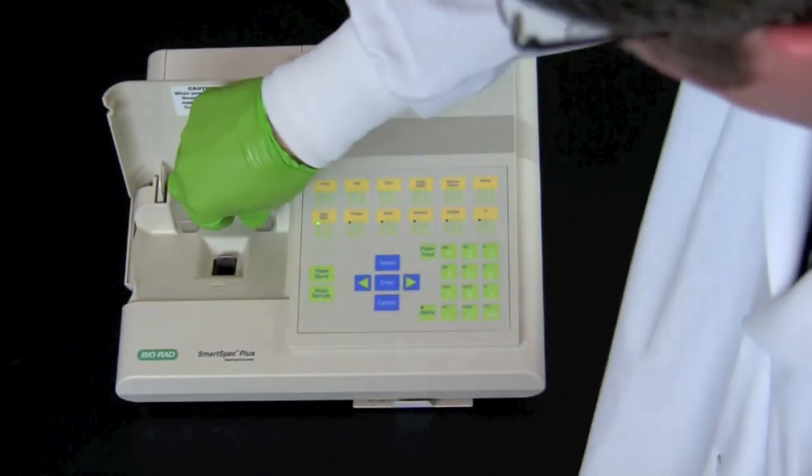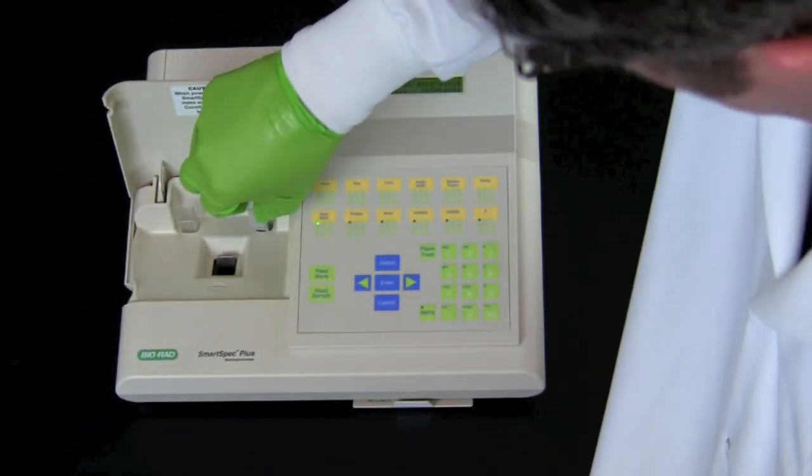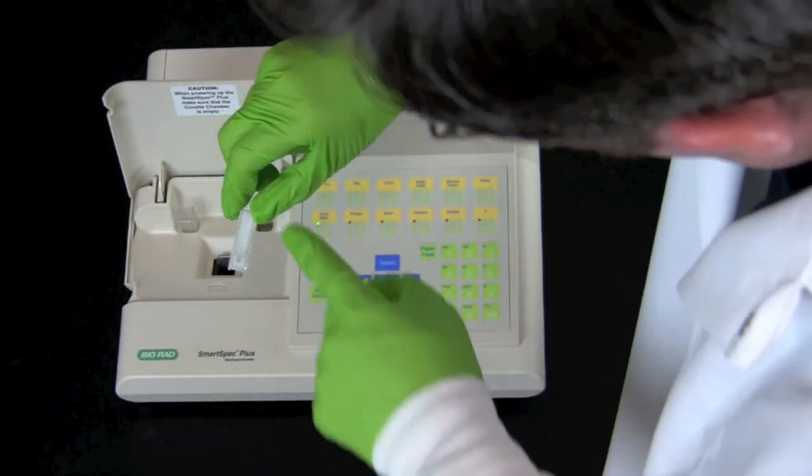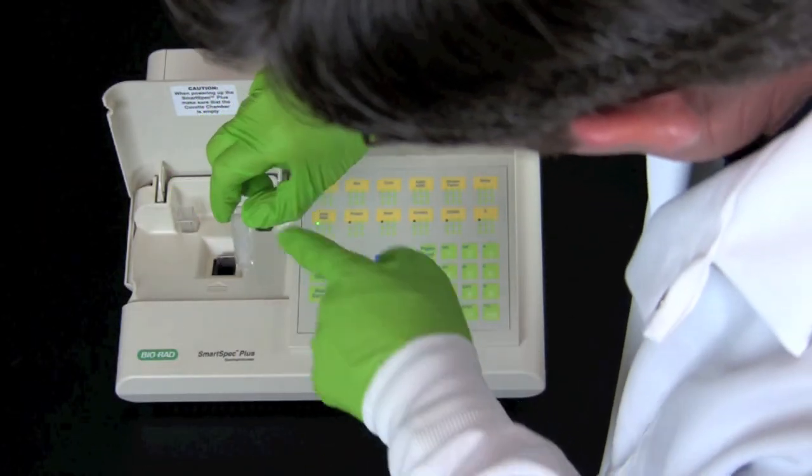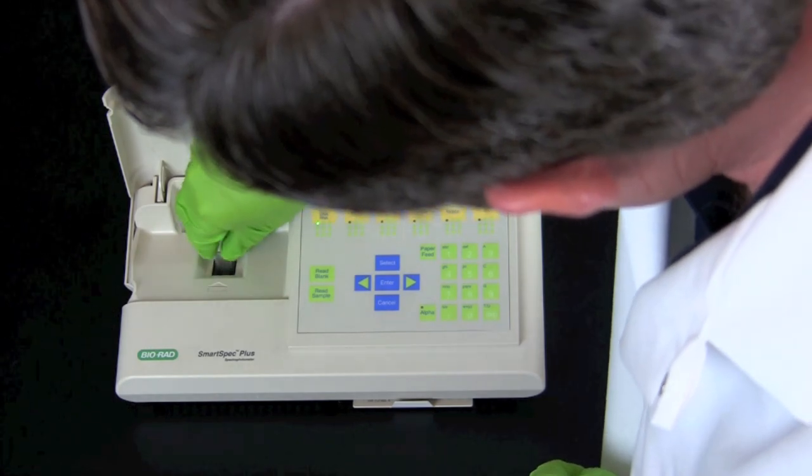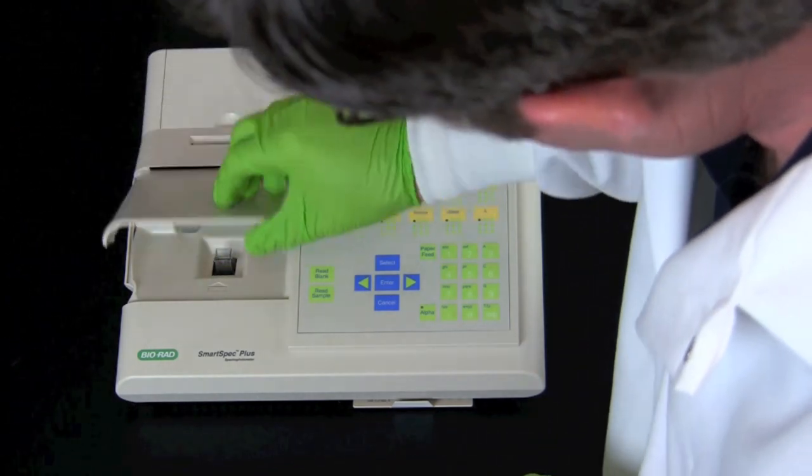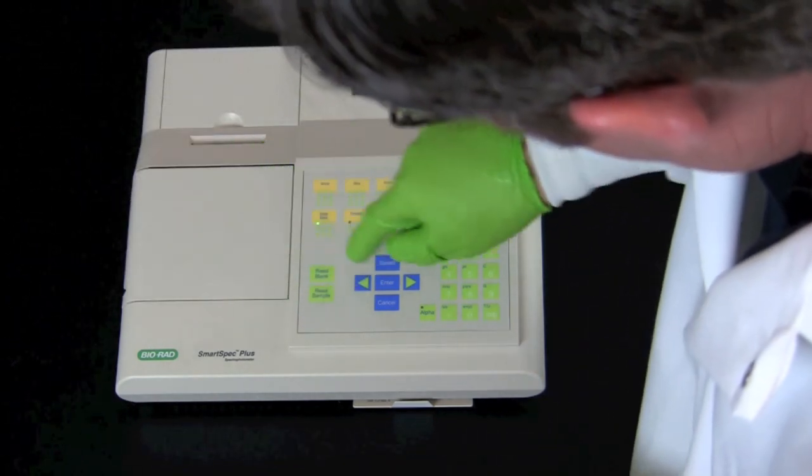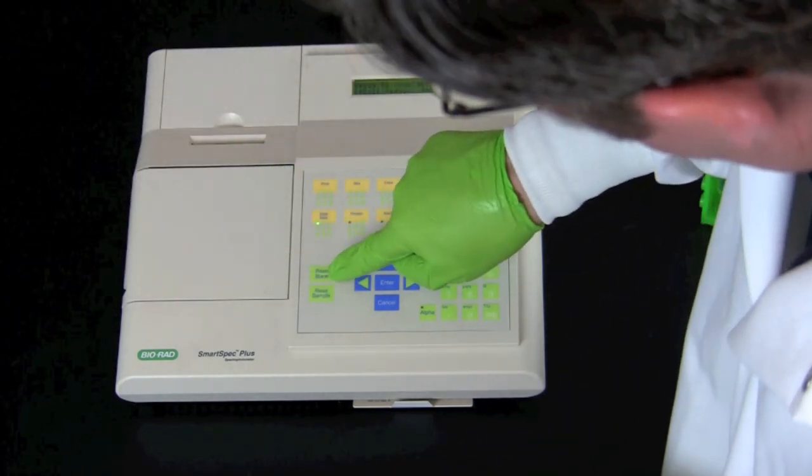Insert the control cuvette, making sure the correct side is facing forward. Press the read blank button.